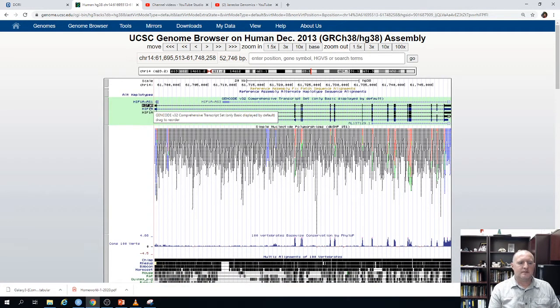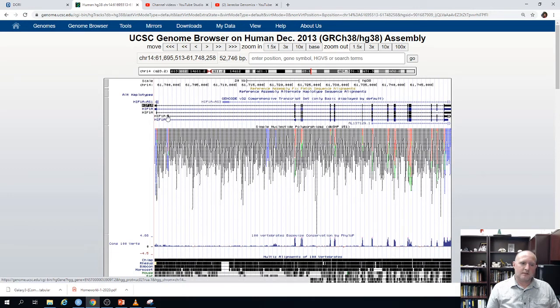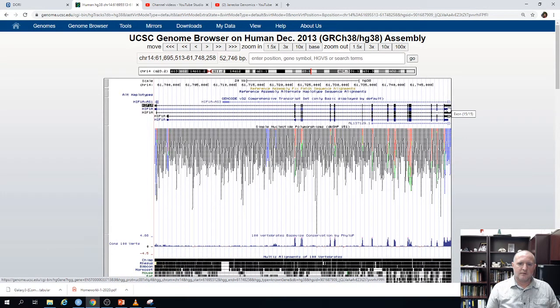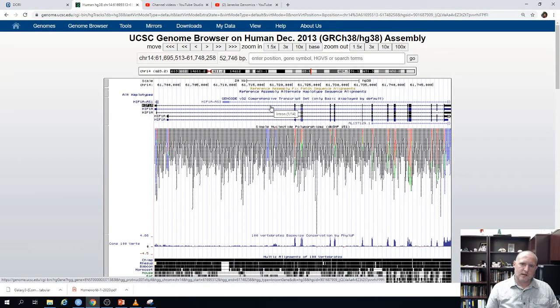HIF1-alpha is a very important transcription factor that regulates the hypoxic response in cells to low levels of oxygen. There are multiple gene models because there are multiple characterized transcripts for this gene. In each gene model, the ends show untranslated regions as medium-weight rectangles, the thicker bars represent exons, and the lines connecting them are introns. Arrows on those lines show the direction of transcription — HIF1-alpha is transcribed from left to right.